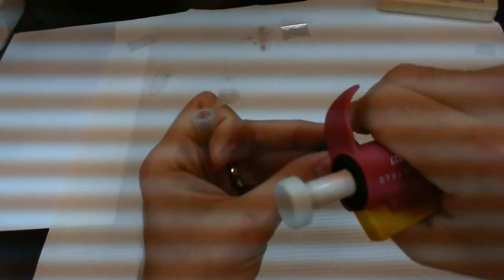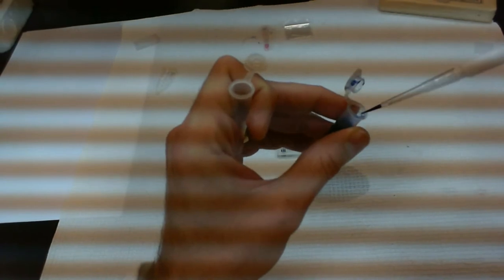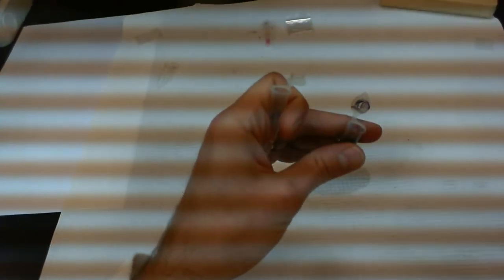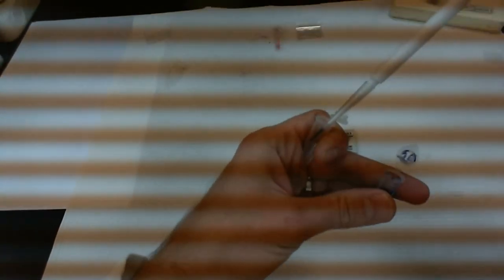I'm going to dilute this with 20 microliters of trypan blue. I'm not expecting a very concentrated culture, so I'm just going to use 20 microliters. Again, this is a P10, so I'm going to take 10 microliters and 10 microliters, so I'm going to pipette twice. I'm going to set it on the side of the tube so I don't have to change my tip every time. Do it twice. Remove the tip. So my trypan blue goes away. Here's my sample. I'm going to just tap this down. Okay, and so there is my diluted sample.